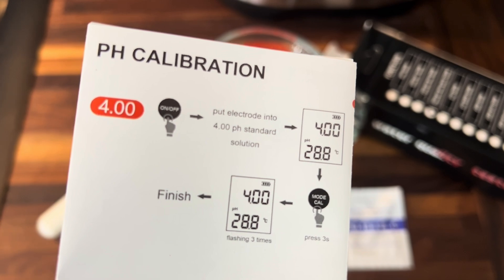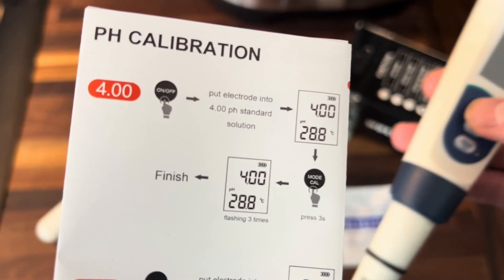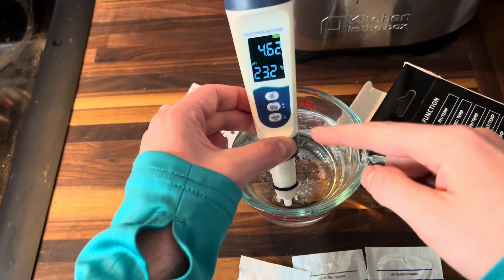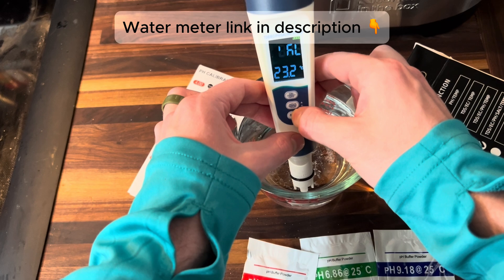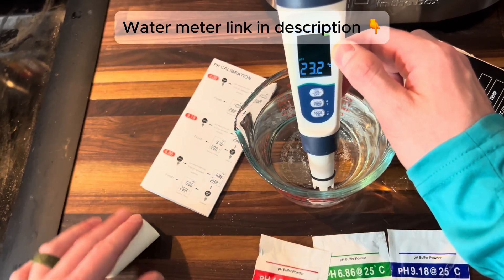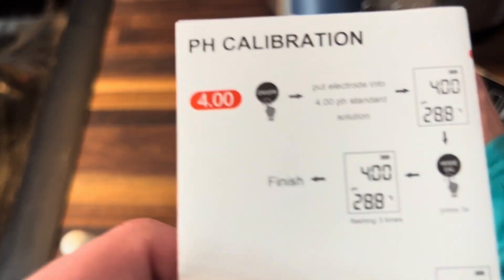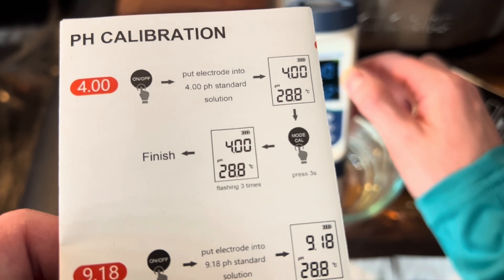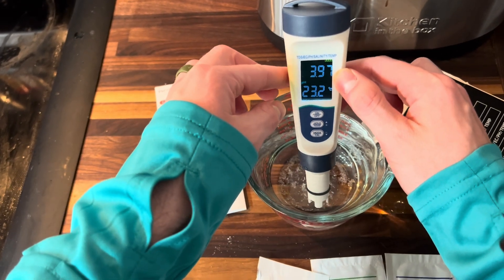Now it says to put the electrode into the 4.0 pH standard solution. We're going to go ahead and turn this on. The next step is to hold the calibrate button for three seconds, and then you'll see 'calculate' at the top. See how it says 4.0 flashing? It's going to flash a few times, just like it says in the instructions. And now it is calibrated to 4.0.